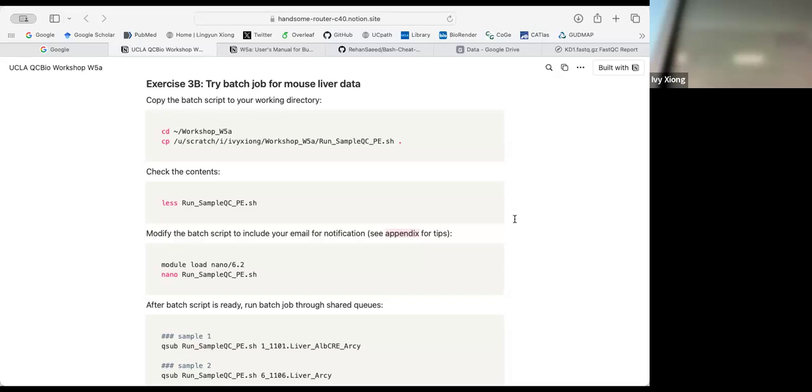You have to change it. So they know what file they're going to use. The only thing I have to do is add it, change it, and leave the hash.